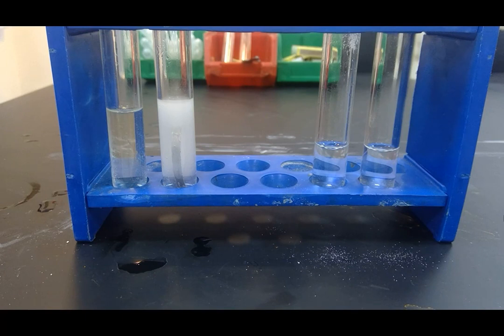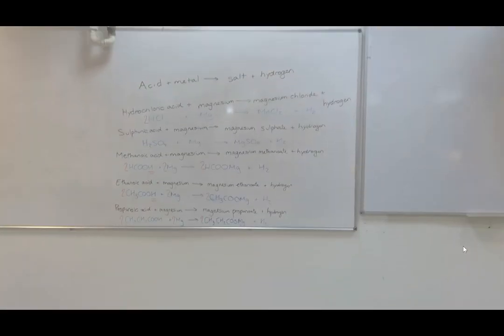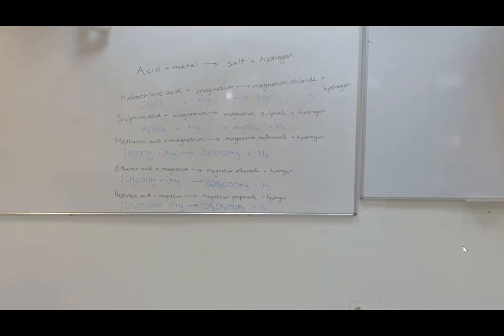Obviously now the reaction in the hydrochloric acid is finished, which is why the ethanoic acid still has more bubbles in this case.